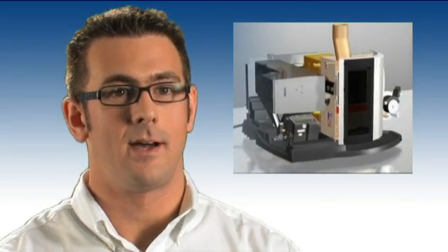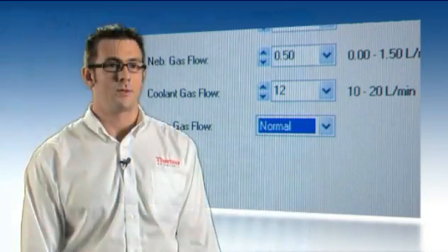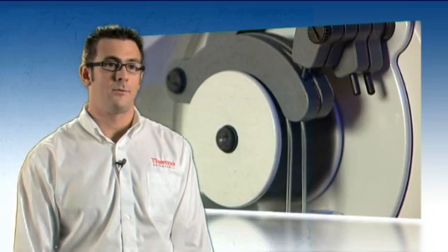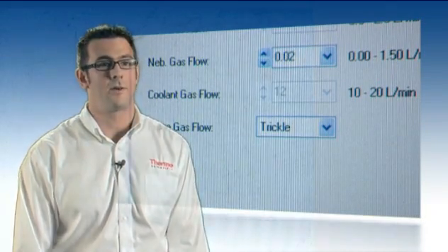One of the major savings comes from the small optical tank design of the iCAP and our sophisticated distributed gas purge system, which really allows us to get optimum analytical performance while using very low purge gas flows. This can save customers up to 20% in terms of argon gas costs, and these powerful instrument attributes enable the instrument to achieve unparalleled cost efficiency for sample analysis in any lab.